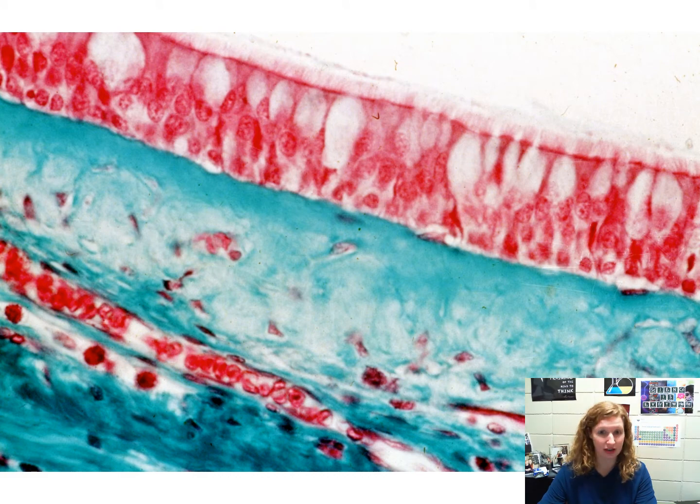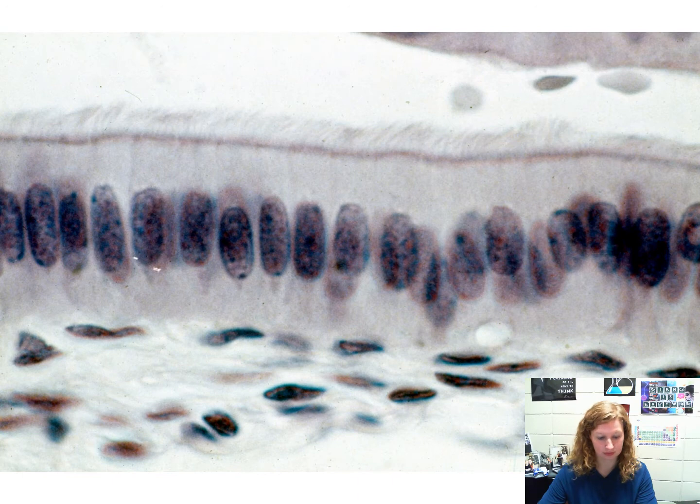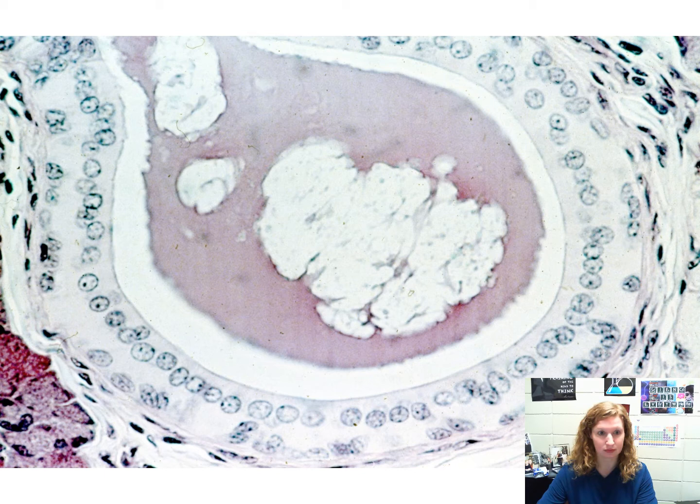Pseudostratified ciliated columnar epithelium. This is stratified columnar epithelium from a salivary gland.